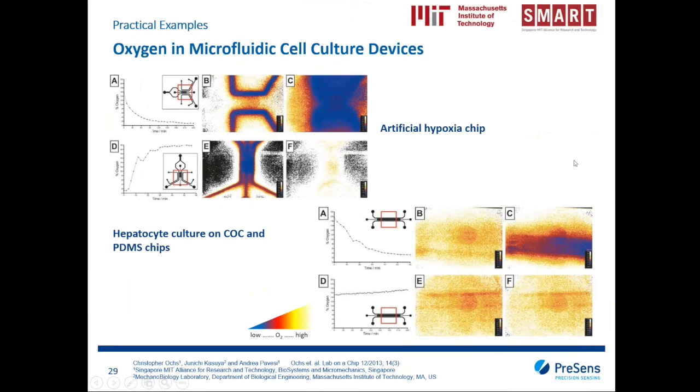Now let's head on to more specialized cell culture imaging. This slide is on oxygen imaging in microfluidic cell culture devices. Actually, I gave a webinar especially on that topic about 3 months ago. You can send me an email request and I can send you a link for the YouTube video, or you can also Google the YouTube video on that.